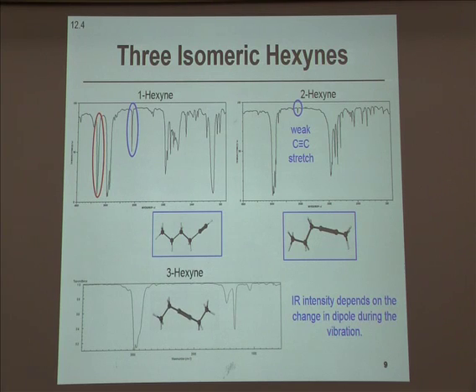of that transition. So the important thing to remember here is that sometimes the absence of a particular stretching feature in the IR spectrum doesn't actually mean the absence of that structure in the molecule itself. All three of these structures have triple bonds, and the intensity of that signal changes greatly depending on how that triple bond is substituted. So for symmetric bonds, there may be little to no intensity for their absorptions.